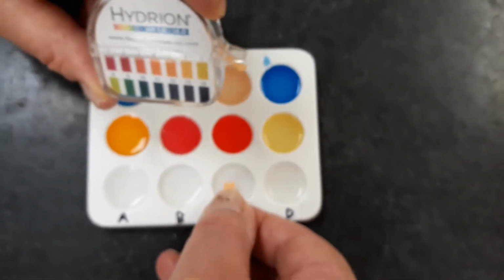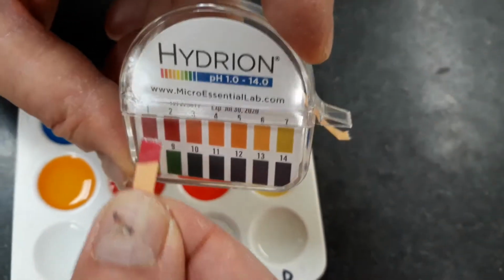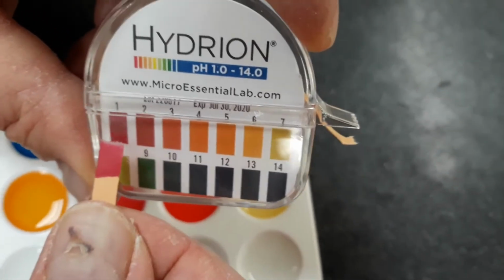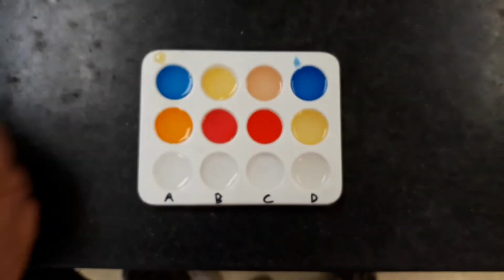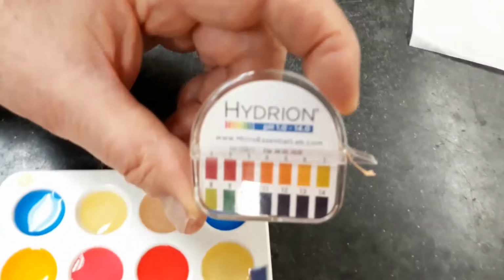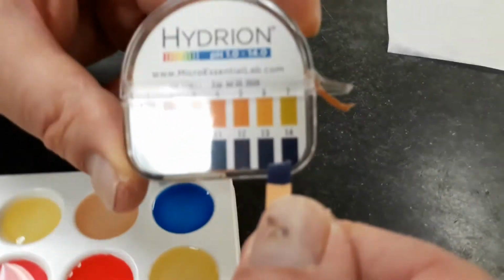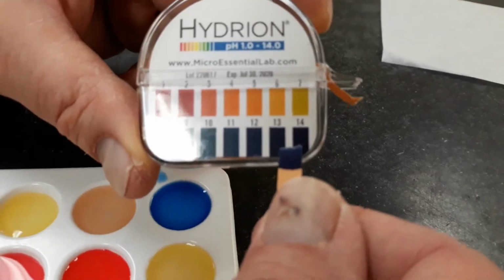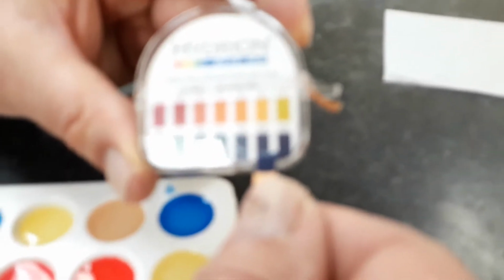Substance C is a dark red. Looks about like a 1. And substance D is about 14. And it's a dark midnight blue. Bit overexposed.